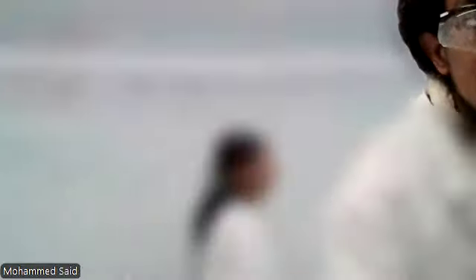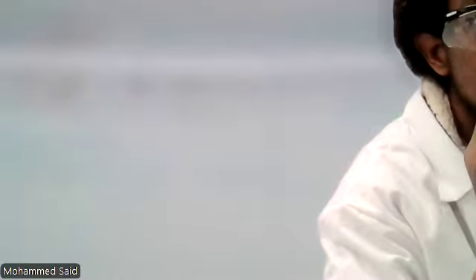They can, yes. I'm going to just share that. Any group that hasn't found PFUs, before you leave, two final reminders. Besides cleanup, PFUs, I need to ask, how many groups were not able to get successful plating results? For conjugation, raise your hand. For conjugation, your task is to ask another group to see what the results are, compare with yours, and describe in the discussion why. For the plaque assay, raise your hand.